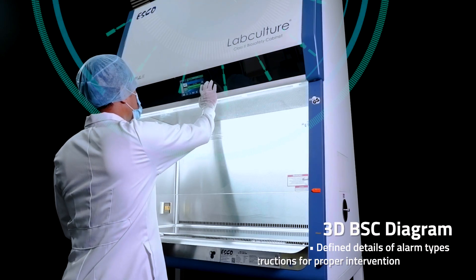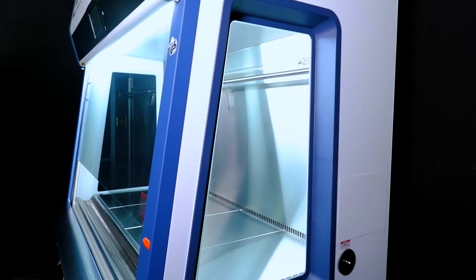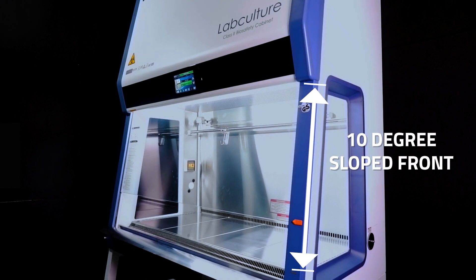Virtual alarms via the 3D BSC diagram. With a sleek, purposeful design, the 10-degree sloped front optimizes user comfort.